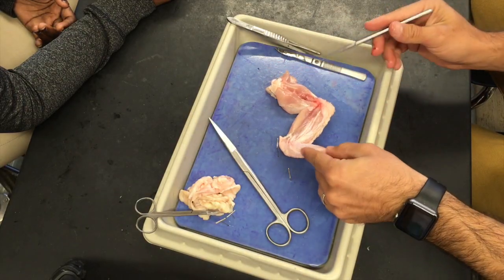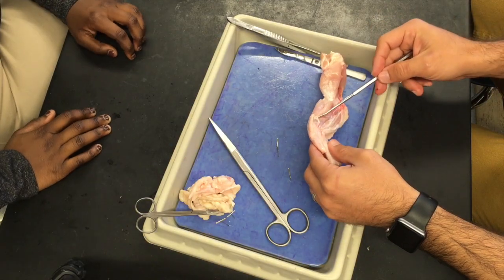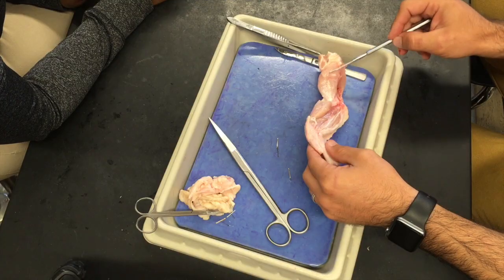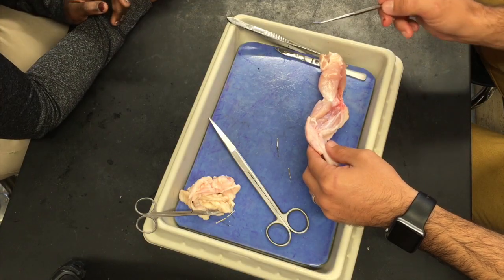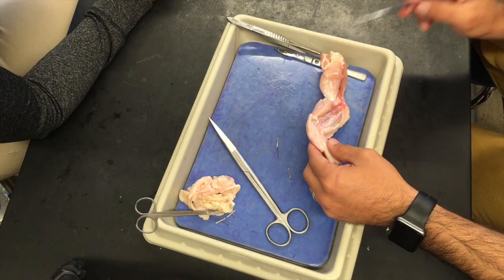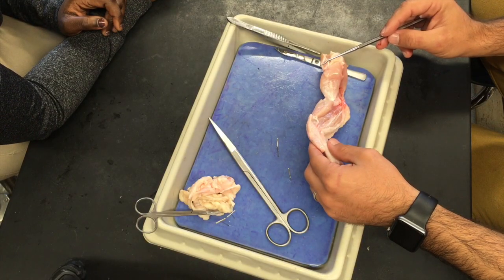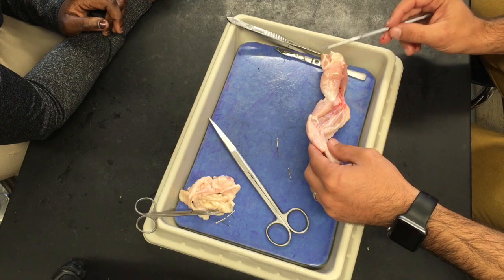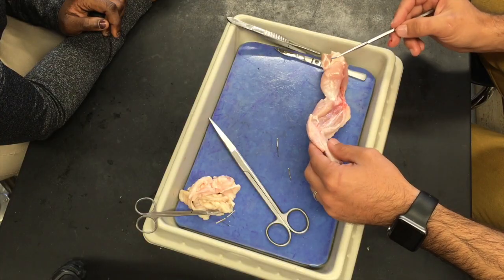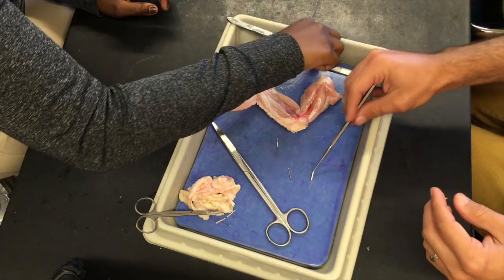Now what we want to do is start removing these muscles. If you can keep these muscles relatively intact as you remove them, that'd be awesome. Try to remove individual muscles. Then we're going to get down to where I want you to be able to see a ligament. What do ligaments do? They connect bones to bones. So we're going to have to remove all these muscles to where we can just see bones, and then we'll be able to see some ligaments. When you can find a ligament, point it out to me. Keep it going.